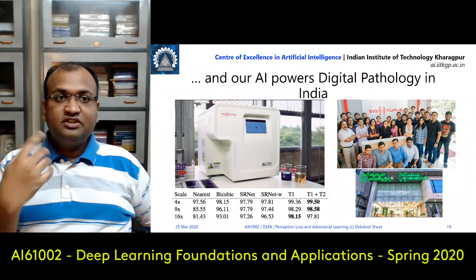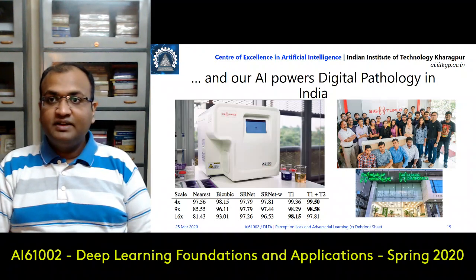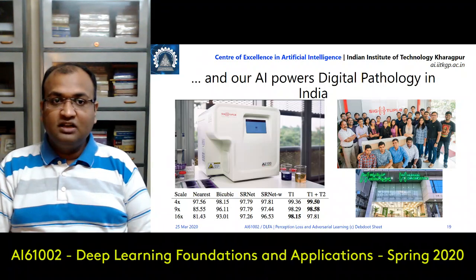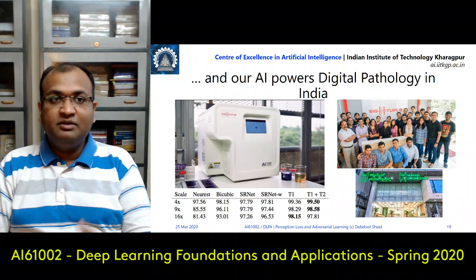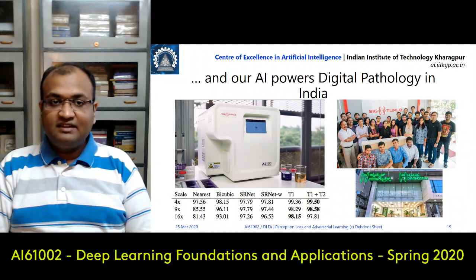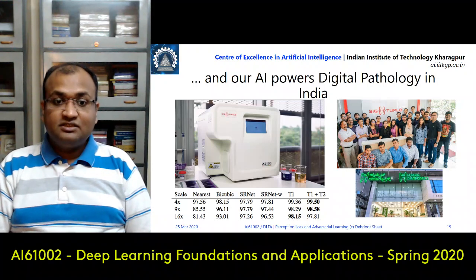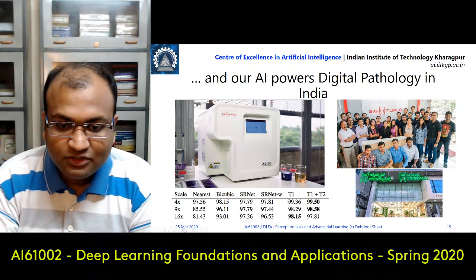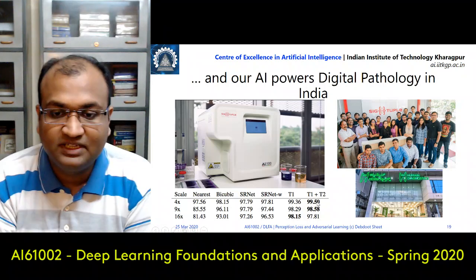This was just to look at how much impact this super resolution has in terms of a drift in performance on the actual object I am imaging. Here we realize that because of this change, there is not much of a change, because you have almost 98 to 99% concurrence, and that is really interesting.